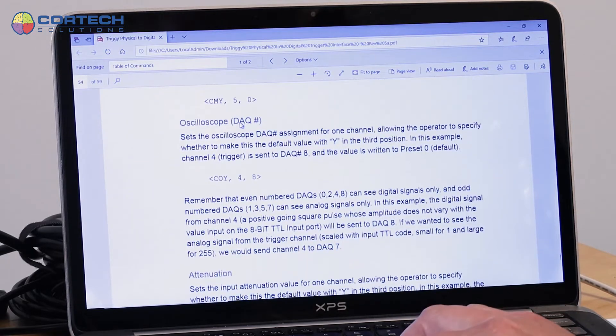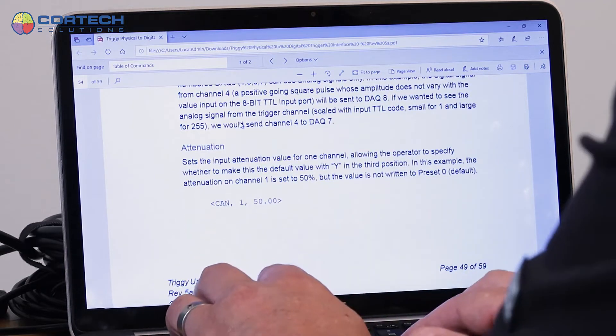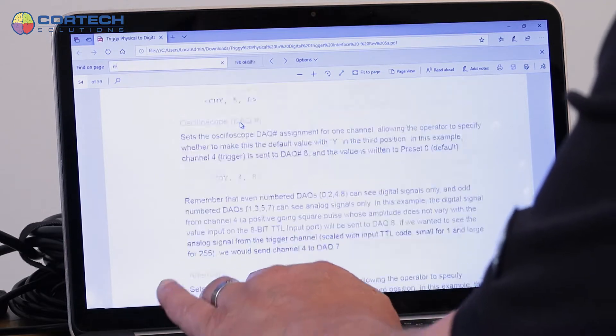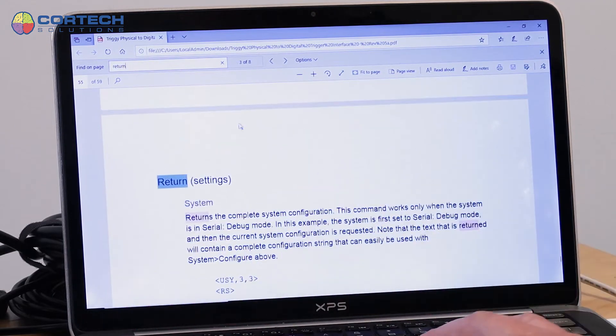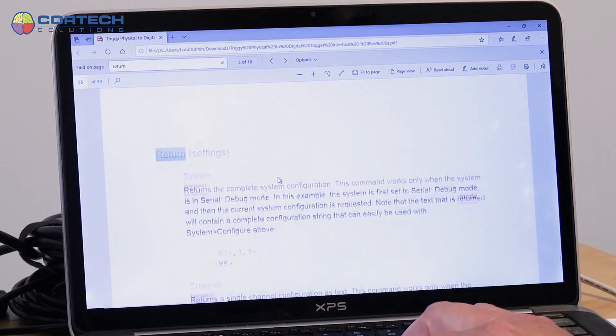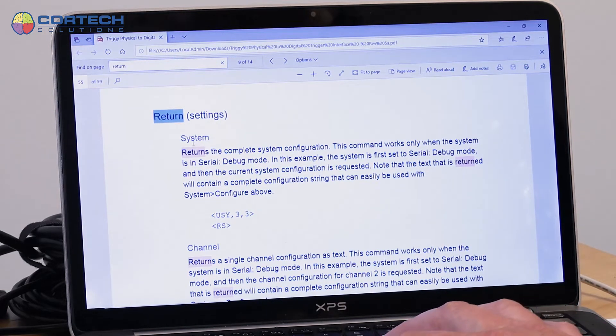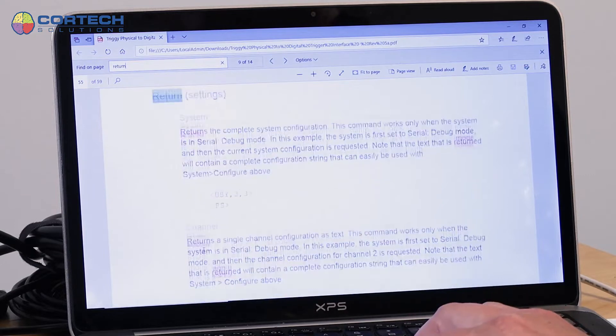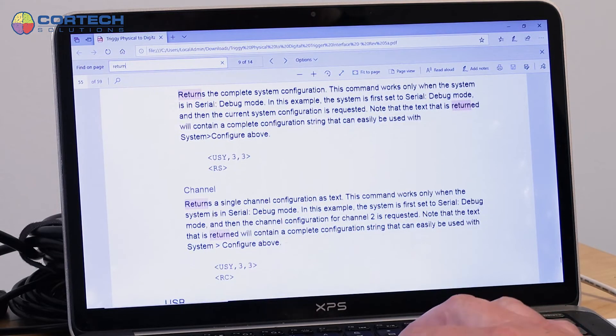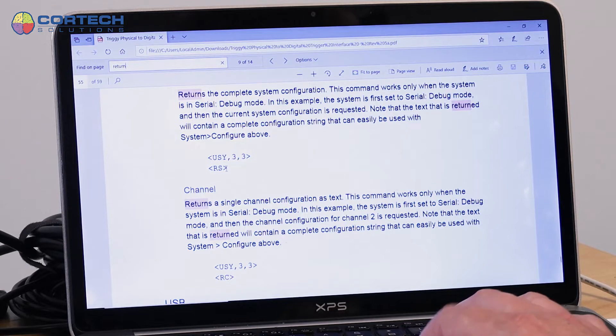Let's go down to return settings. So there's return settings for the system or return settings for a channel. Let's take the system example, RS.